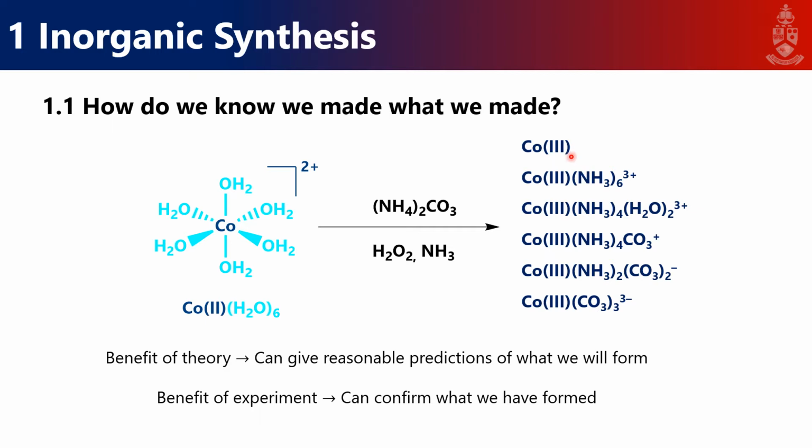Right. So we don't have to keep on predicting and argue or logically justify why we think something has formed. We can actually test experimentally if something has indeed formed. And that's what this experiment is about. We start with something, we do a bunch of things to it, and then we confirm whether or not things have formed. And that together is the basis of inorganic synthesis. That's exactly how it is. You react something, you form stuff, you confirm whether or not you've made it by a variety of techniques.